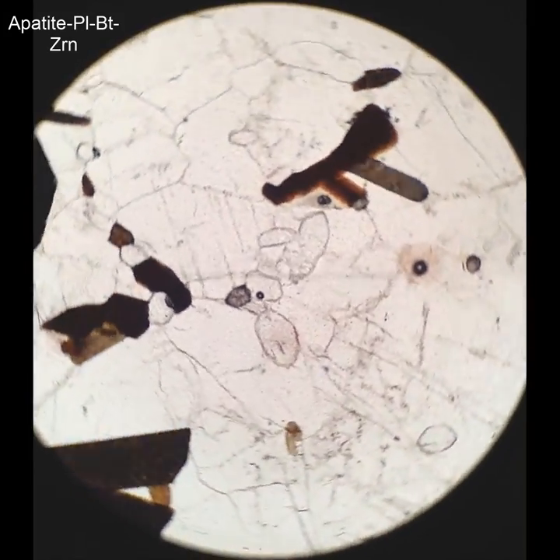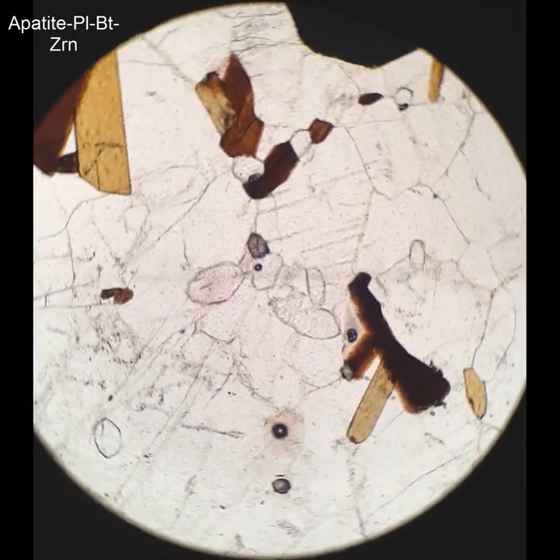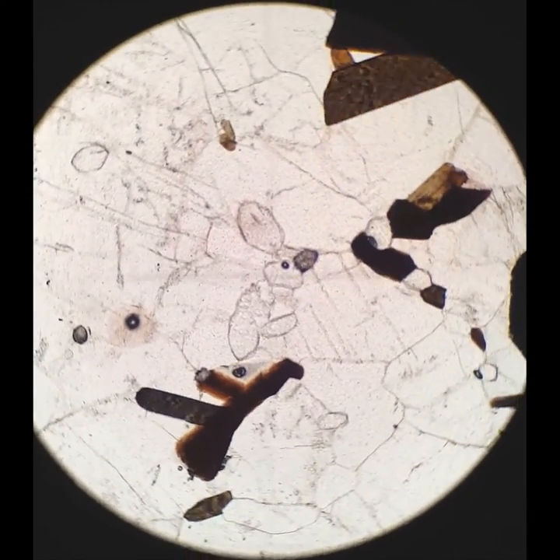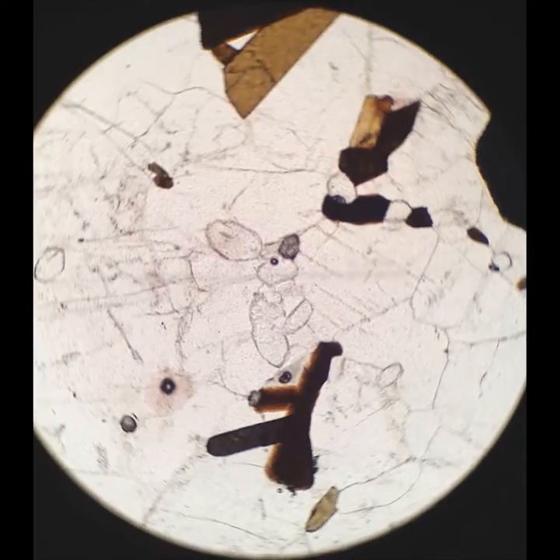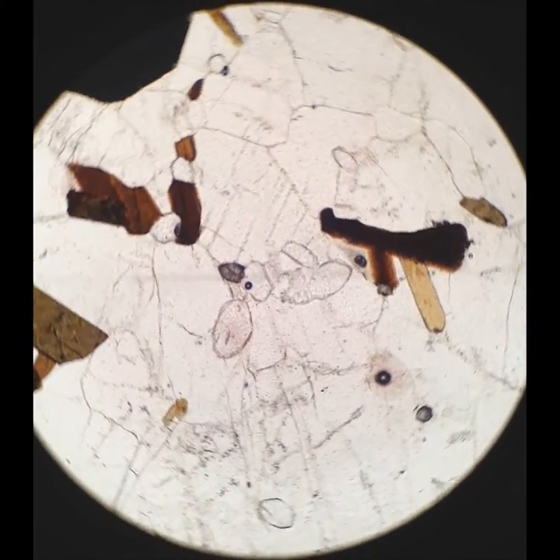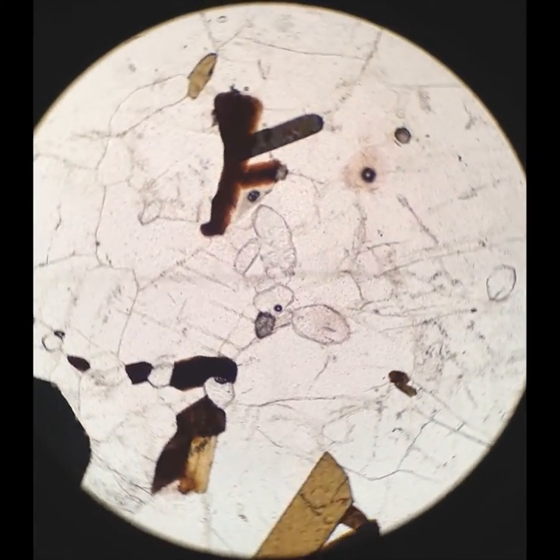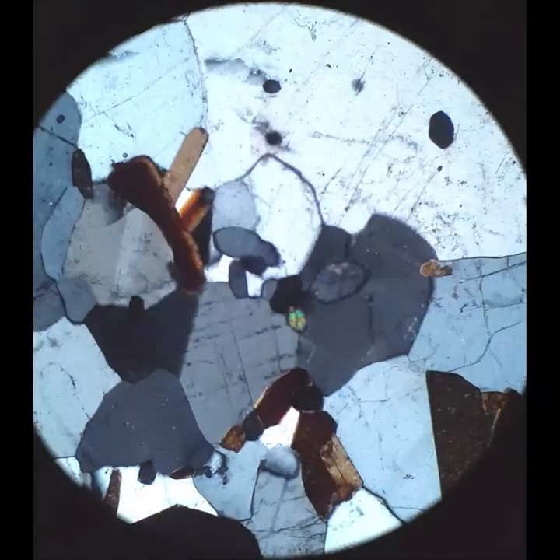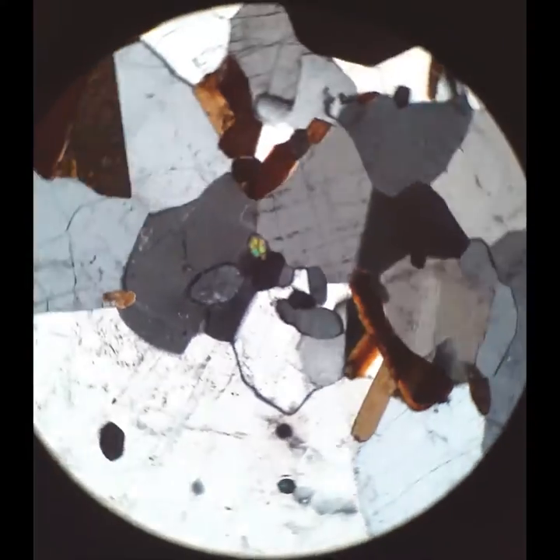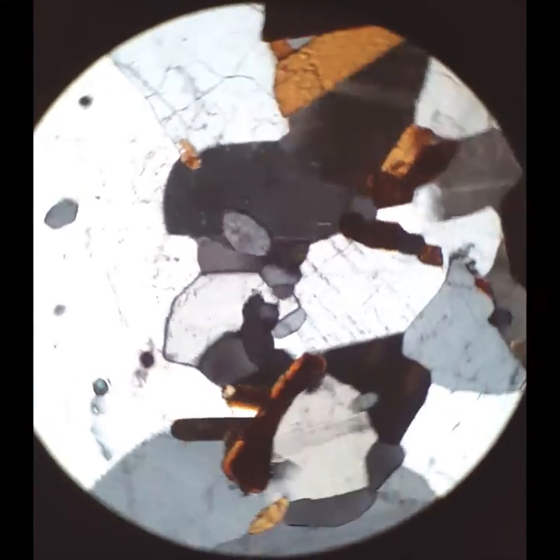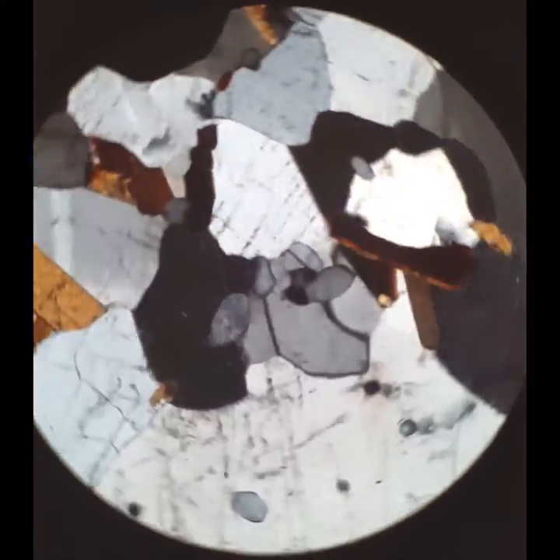Just another little group of apatite crystals in the center. There's also a zircon crystal, which is that little five-sided, almost house-shaped crystal also close to the center. Again, that's super high relief. When you cross the polars, then you can see the apatite grains are those little droplets with gray interference colors. The zircon is the little bright green interference colors on the sort of house-shaped crystal.